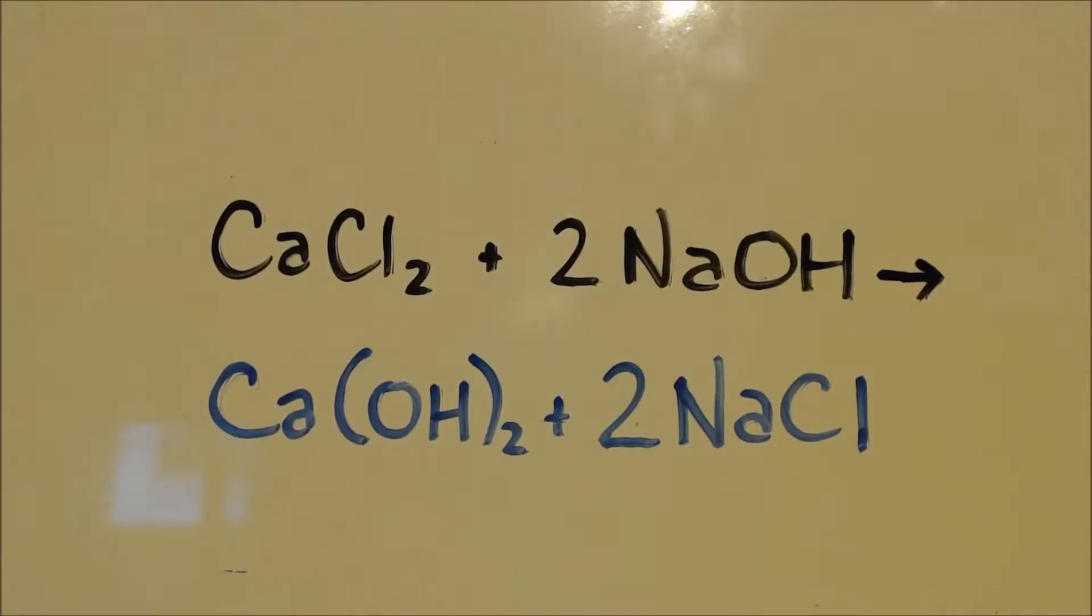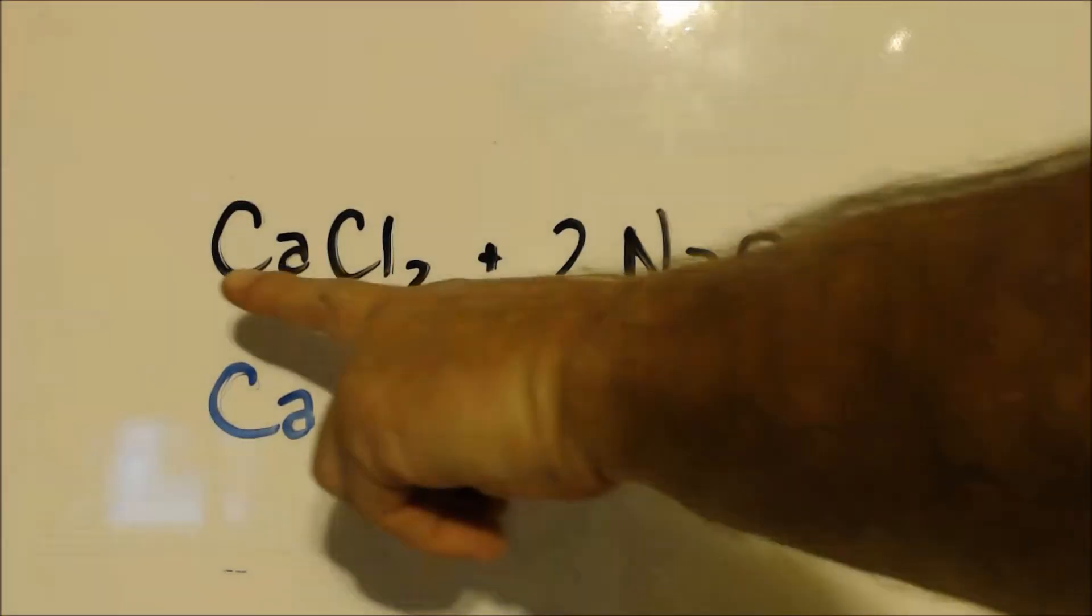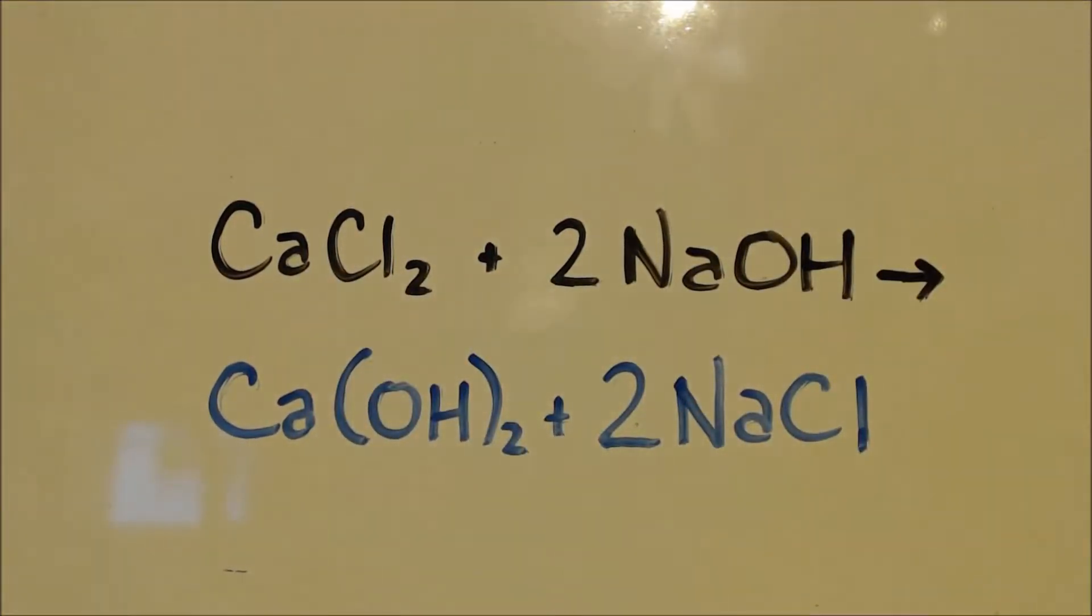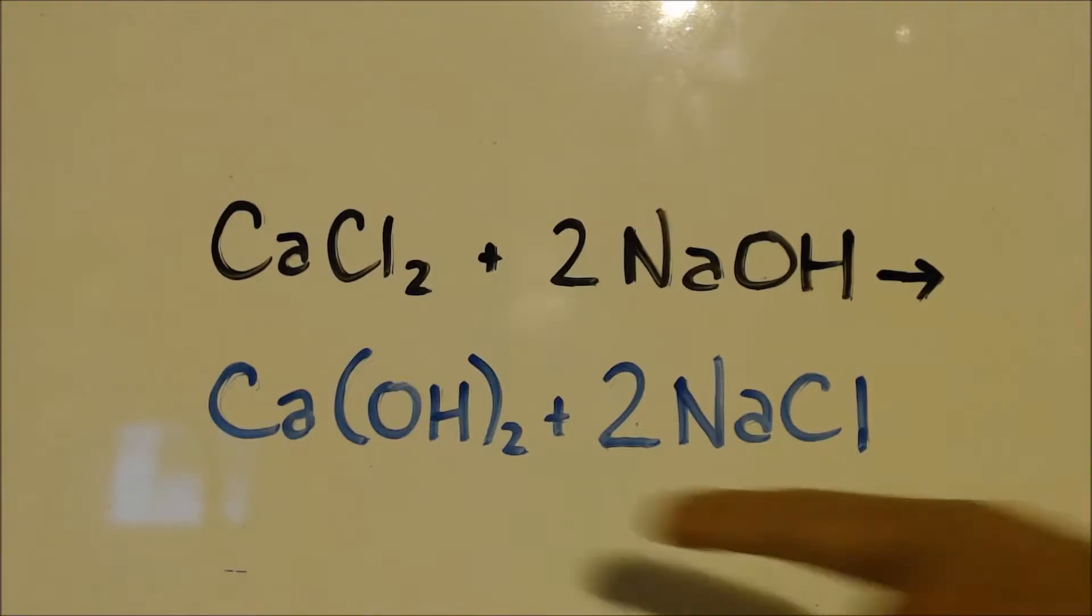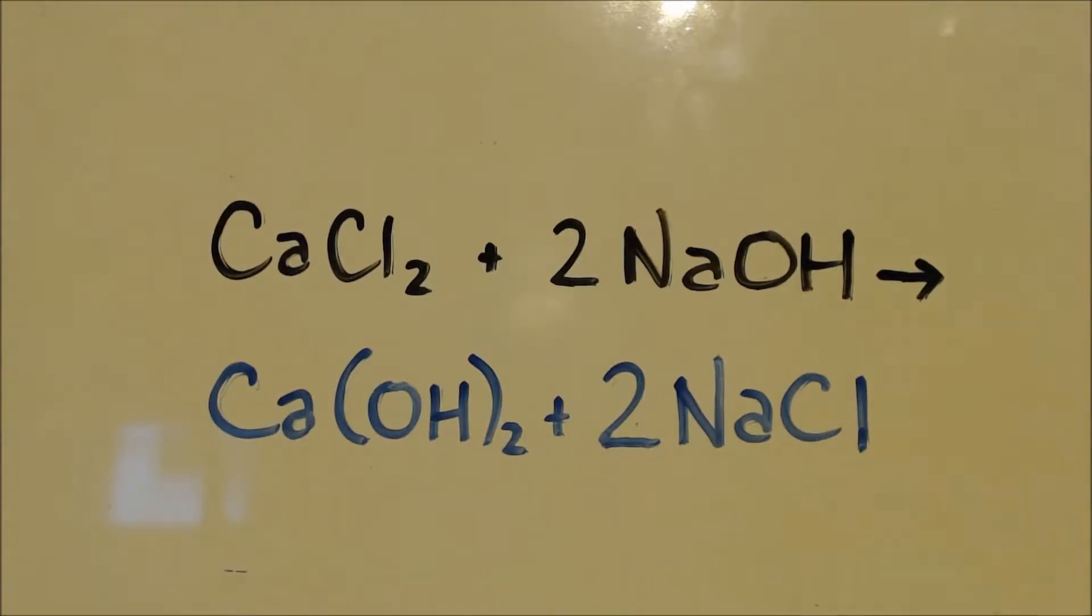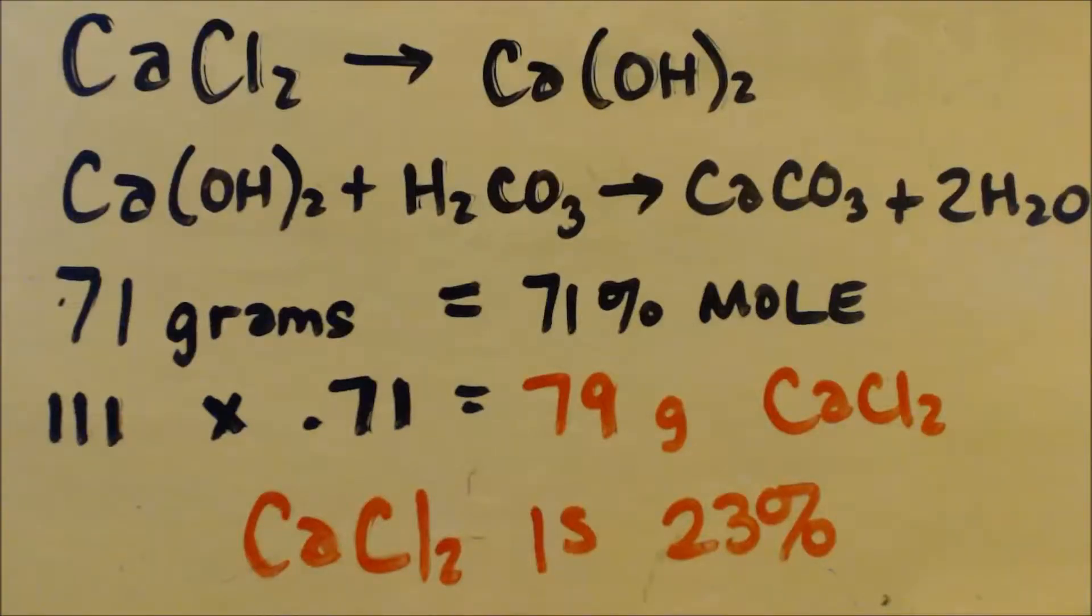This is John Black, superchemist, here to show you how to make some calcium hydroxide. Here's the equation: I'm going to use some calcium chloride and some sodium hydroxide. You can see I need twice as much sodium hydroxide than I do calcium chloride. It will make calcium hydroxide and some table salt.